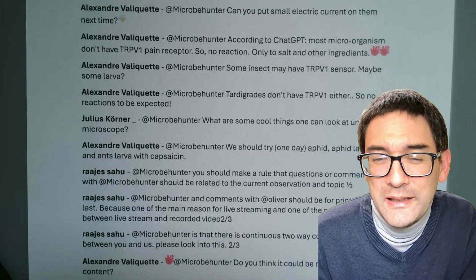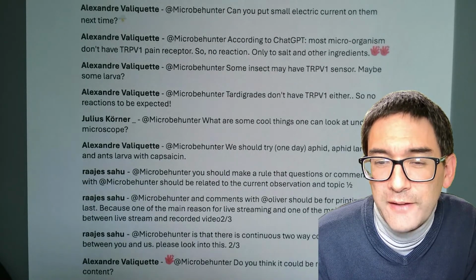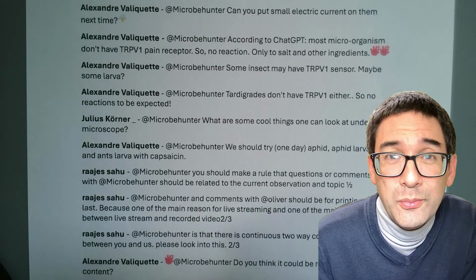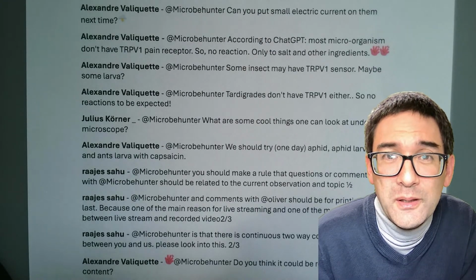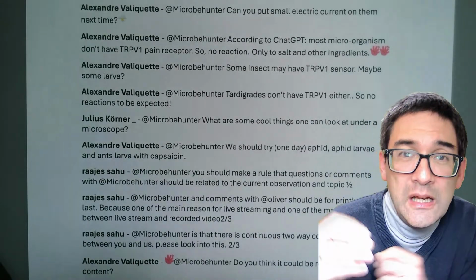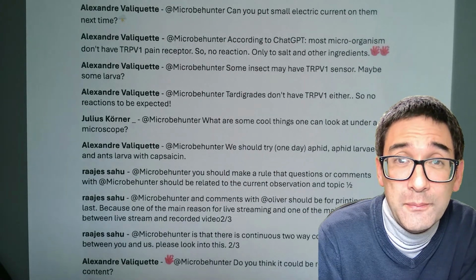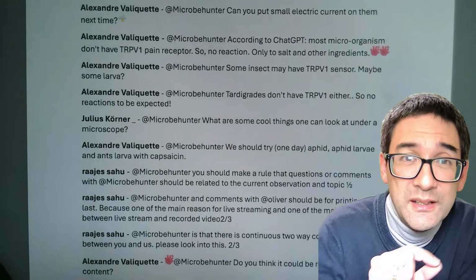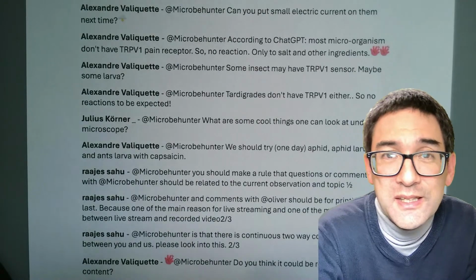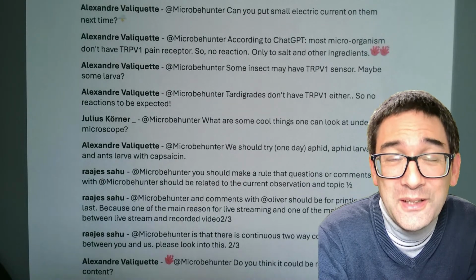Yeah, I tried to find magnetotactic bacteria in 2 different local pond waters. I didn't find them yet, but got a nice surprise, new stuff found. Magnetotactic bacteria I also tried to find. I also was not successful. And what you do is you place some water sample, basically with some pond sediment as well, in a jar, and then on the outside you place a strong magnet, a very strong neodymium magnet, and then if magnetotactic bacteria are present, then you should actually see them accumulate on the inside of the jar because they will move towards the magnet. Yeah, so this is kind of the idea. I have also tried it, also was not yet successful, but I've heard that this should be possible.